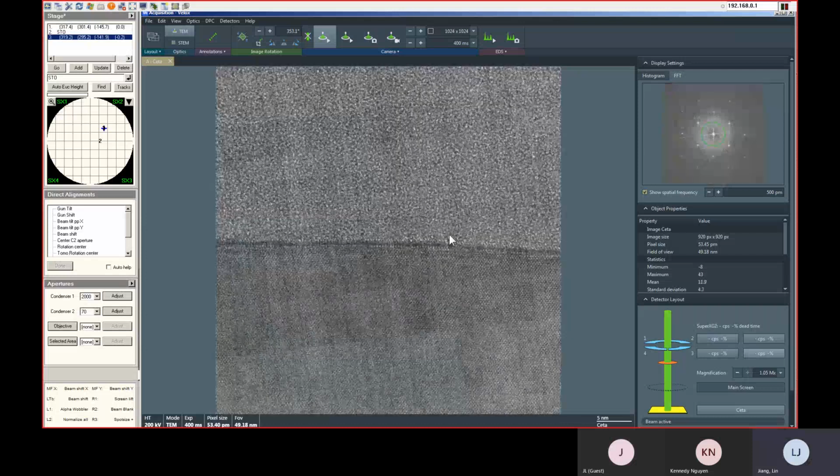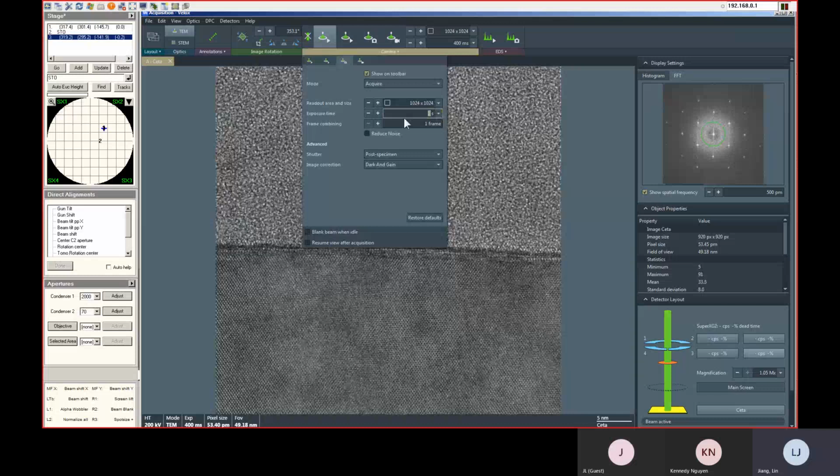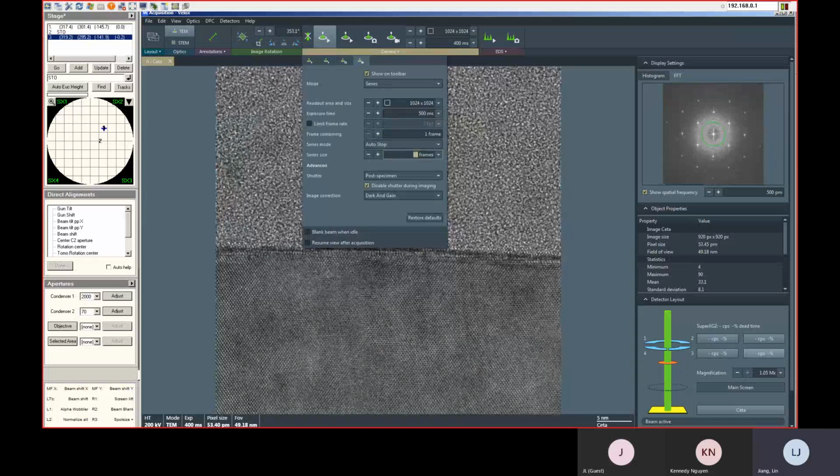I need more exposure time. Like we need to reset one.